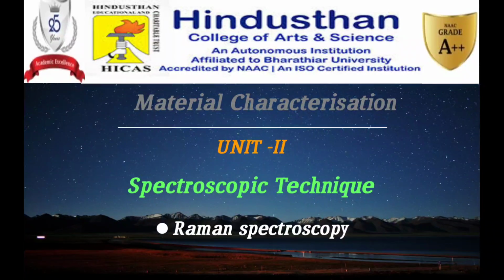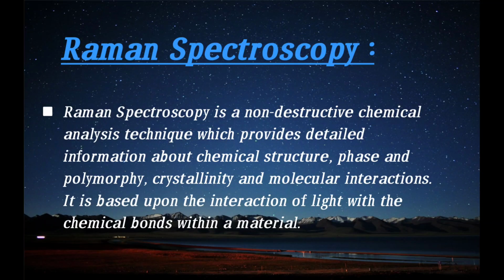Today we are going to see about material characterization. Unit 2. Spectroscopic technique. Raman spectroscopy. Raman spectroscopy is a non-destructive chemical analysis technique which provides detailed information about chemical structure, phase and polymorphy, crystallinity and molecular interaction. It is based upon the interaction of light with the chemical bonds within a material.